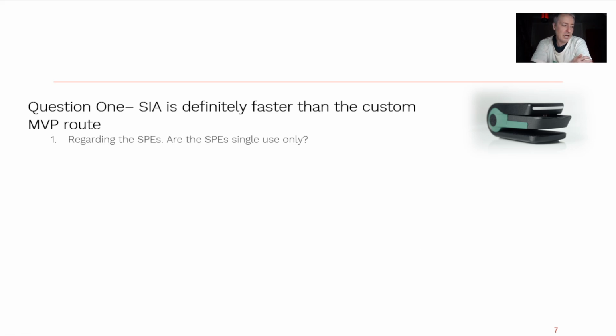They're asking about screen printed electrodes. Are screen printed electrodes single use? Whether screen printed electrodes are single use or not really depends on the assay that you're doing. There's nothing universal about this question of whether screen printed electrodes are reusable or single use. It really depends on what you do with them.